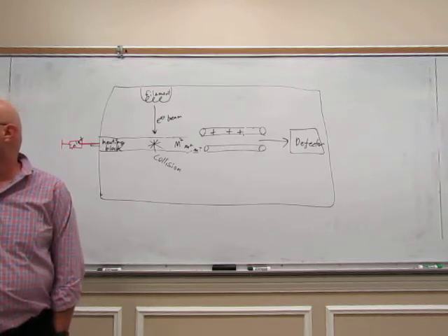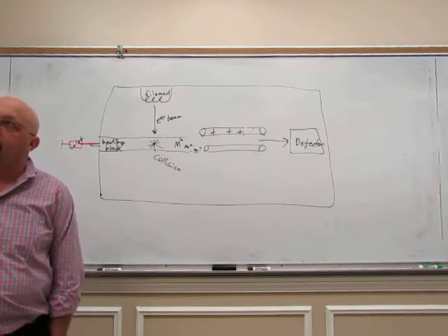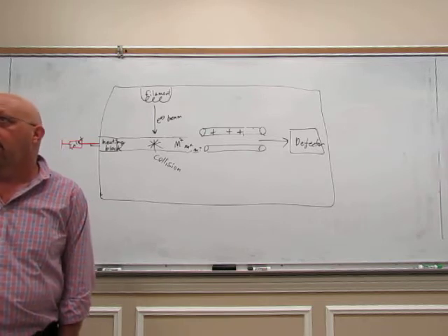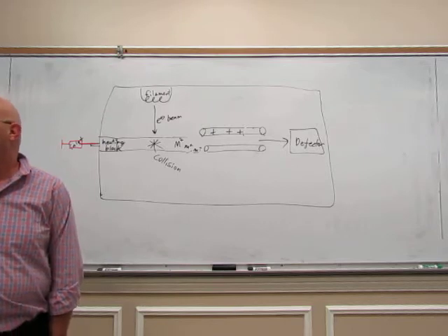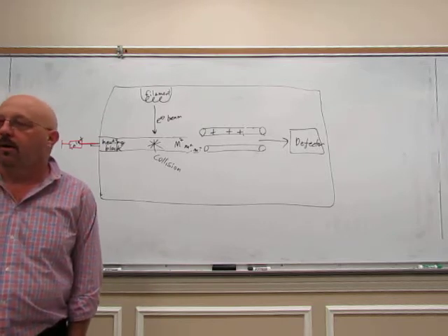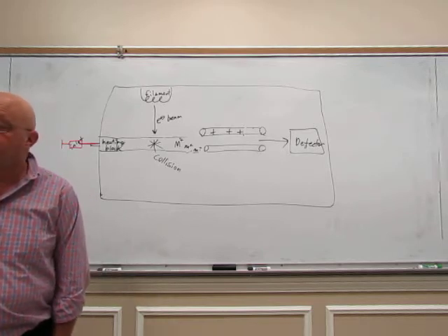Now, those instruments are extremely expensive. You're talking about minimum $500,000 for one of those. So we don't have one of those. Not that many people have the high-res mass spec. Your big schools will, but your smaller schools are not going to have that. The low-res is perfectly good.